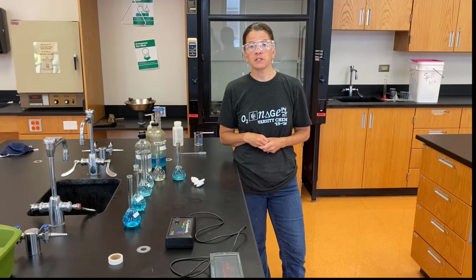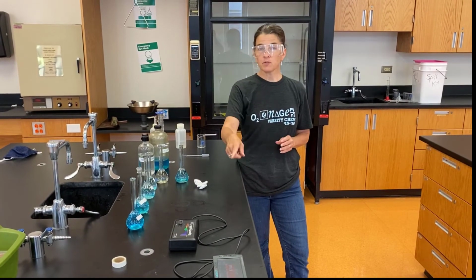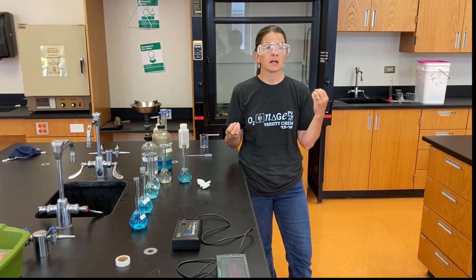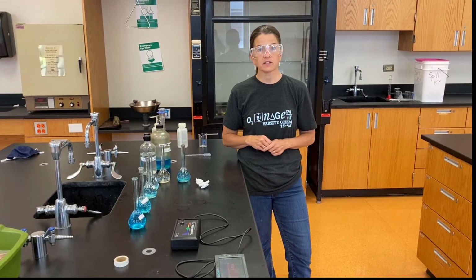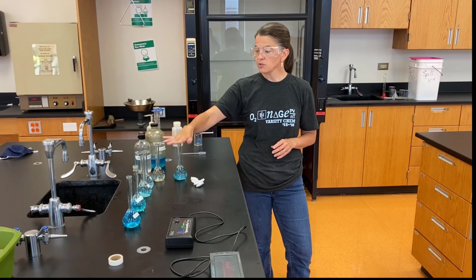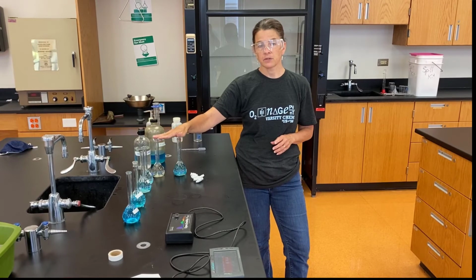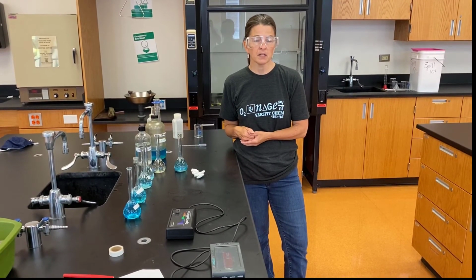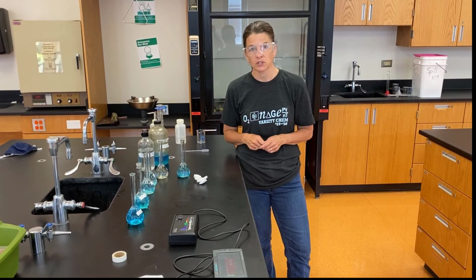So your goal is to figure out the percent copper in each of your samples. From the absorbances, remember you have your graph, and that relates absorbance to concentration. So you can use the equation of the line and your absorbances to find the concentrations of your two solutions. Very important, remember the two solutions that we made were specifically 100 milliliters. So if you know their concentrations and you know their volume was 100 milliliters, you can calculate the moles of copper 2 nitrate that were in those solutions.